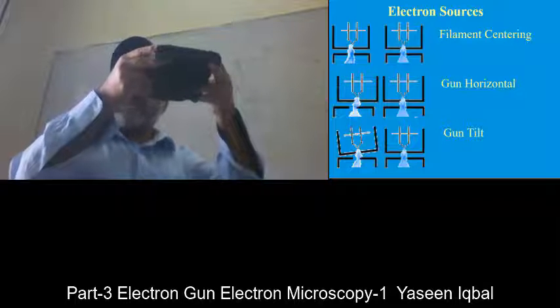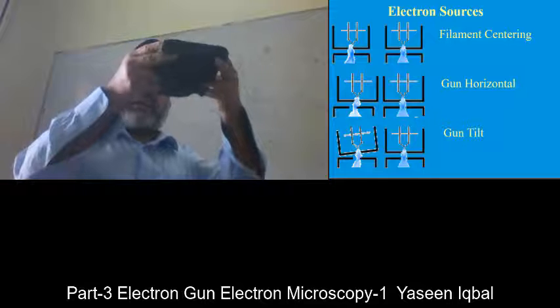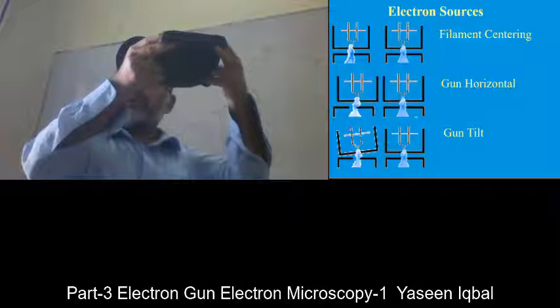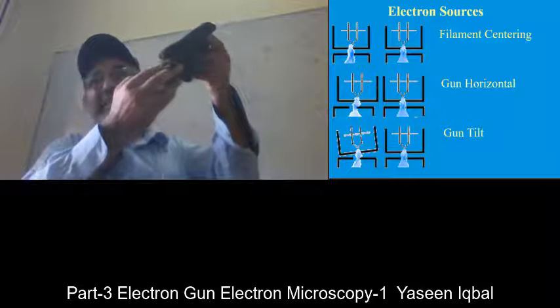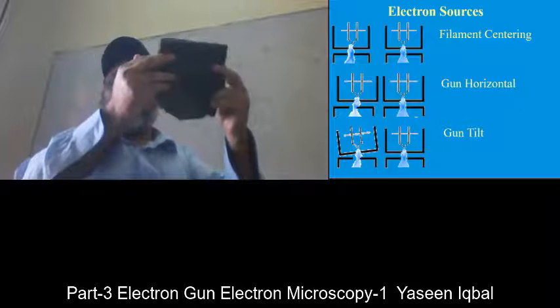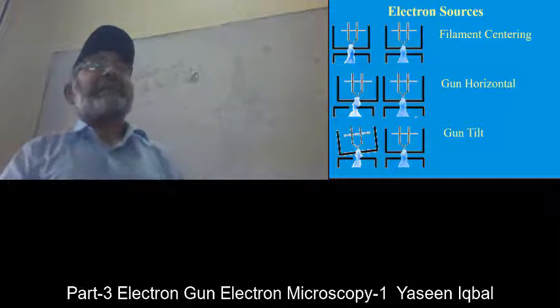The electromagnetic system is designed in such a way that if it is like this in the electron microscope, it will give you the proper number of electrons required to go down. So if this cloth is like this, or like this, or a little bit like this, then you are not getting that information.